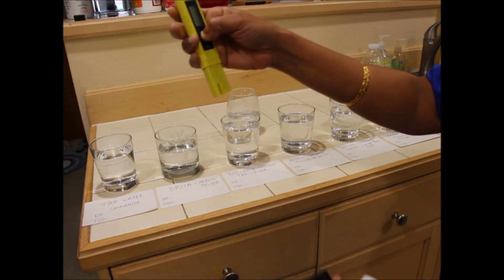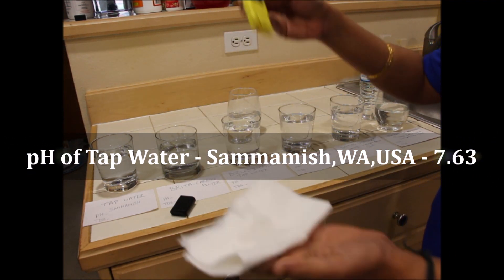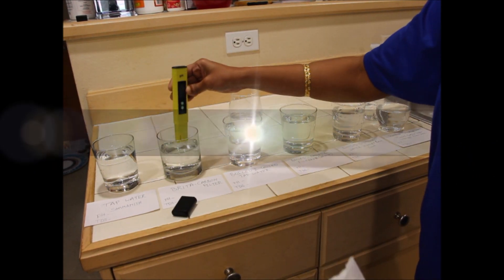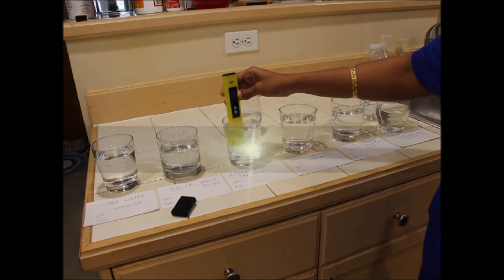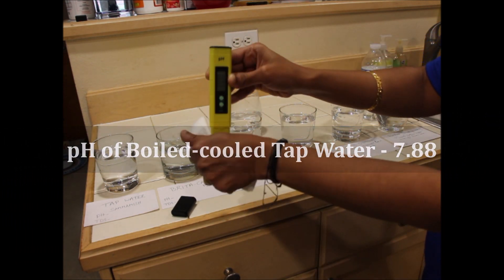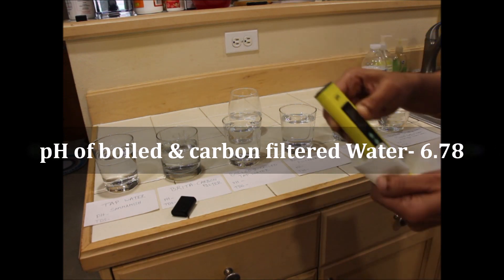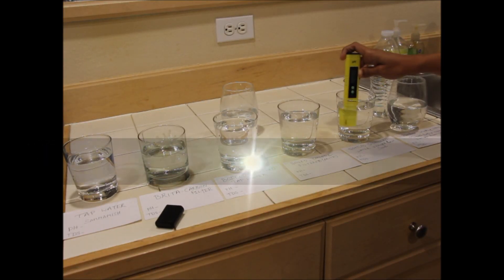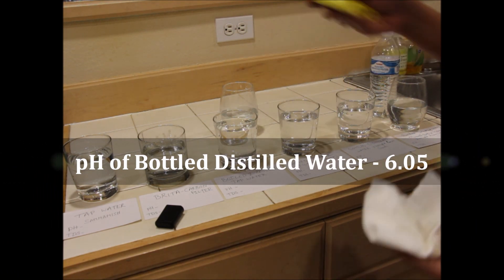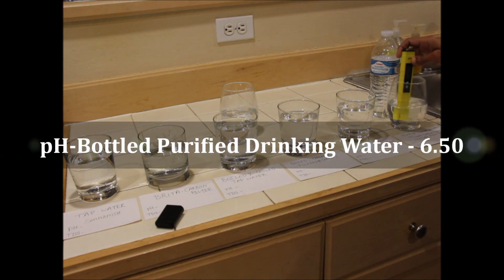Now let us measure the pH value for each water source and record it on the label. Remember to cleanse the meter after you immerse it in each water source. The meter reads 7.63 for my tap water, 6.93 for my Brita carbon filtered water, 7.88 for my boiled and cooled tap water, 6.78 for my boiled, cooled and Brita carbon filtered water, 6.05 for bottled distilled water, and 6.50 for my bottled purified water from the store.